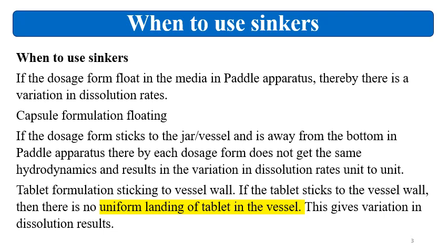Then what is the main role of the sinker when sinkers are required to be used? If the formulation shows floating inside the media in paddle apparatus, then sinkers are required to be used, because if floating is there, the floating will not be uniform for each of the unit, and it will give variation in the rate and extent of the dissolution.